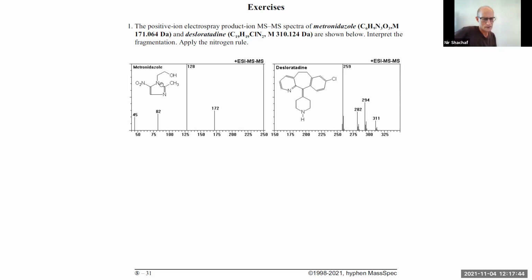I guess that was the most probable explanation. C2H4O. Yeah. So what you actually do is you cut here. You get hydrogen rearrangement to the nitrogen, and then you keep the charge at the bottom. Exactly. Thanks for giving the full explanation.